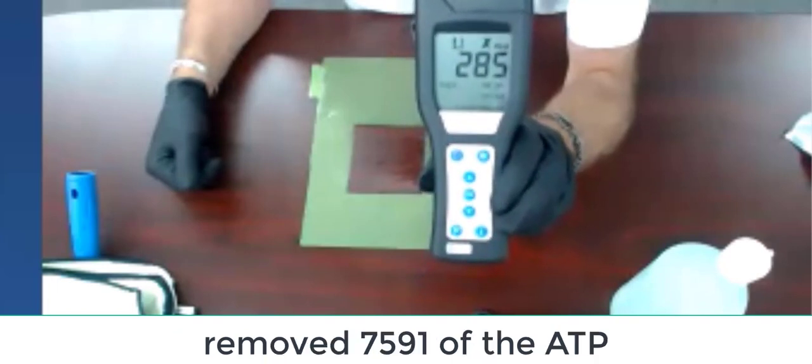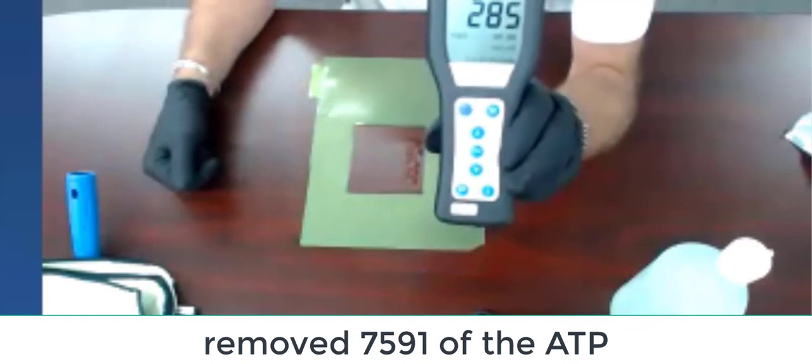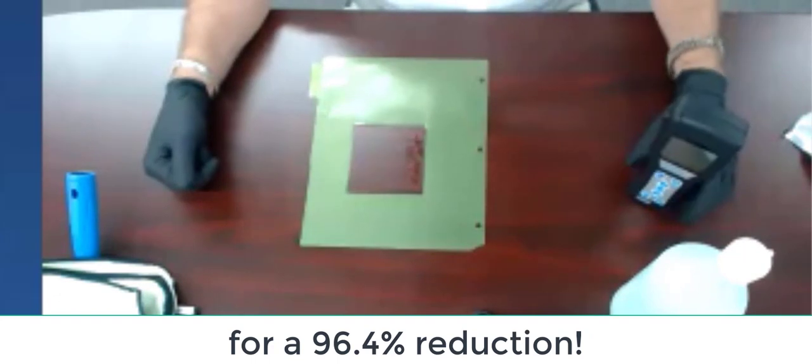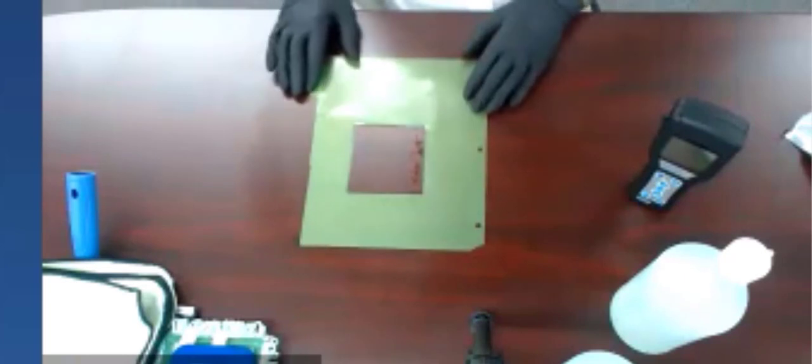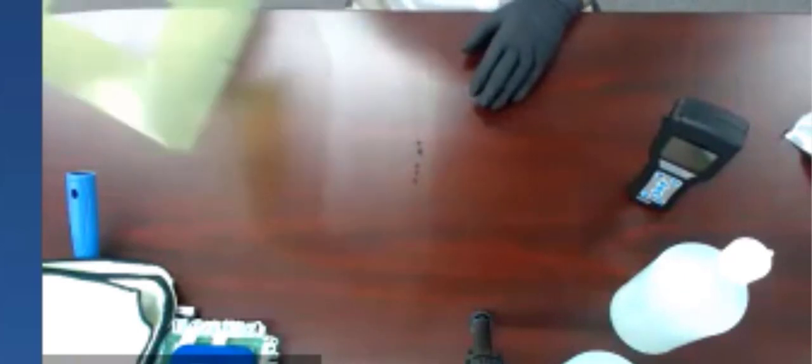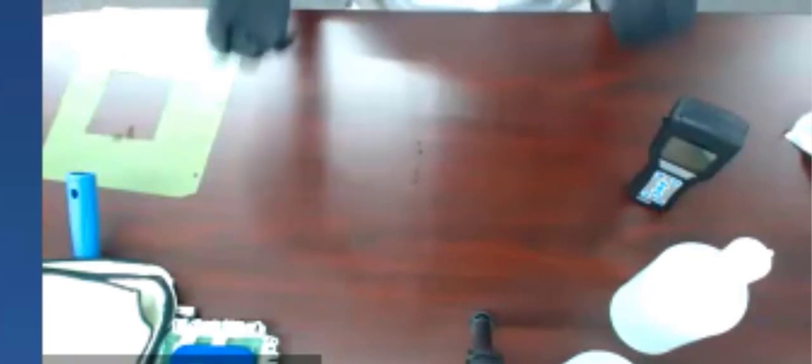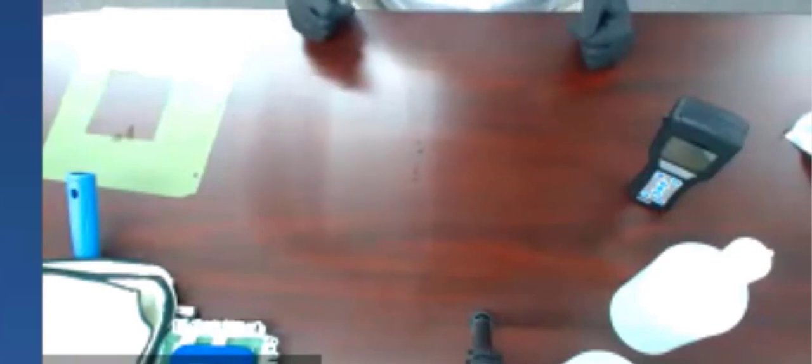285. Would somebody do the math while I'm doing the next step and tell me how much our percentage of reduction was? I mean, I can tell you from 27000 down to less than 300. What would have happened if I would have used a disinfectant on that? Would the disinfectant have killed anything? Nothing because there's still that soil on there. Thousands of microbial life.